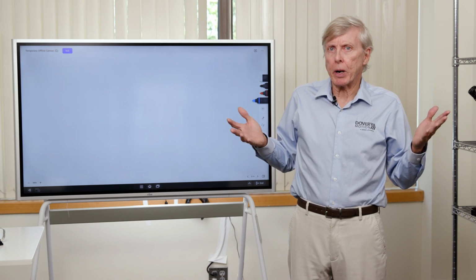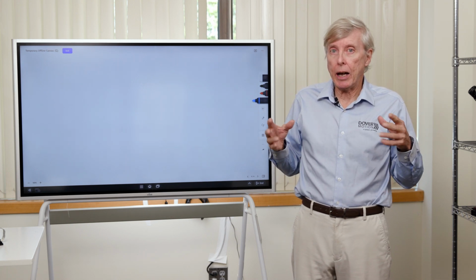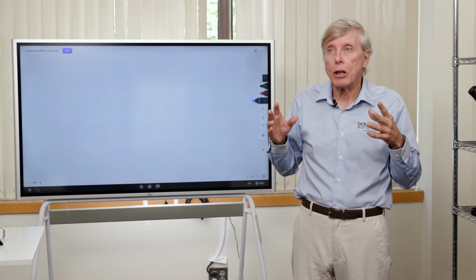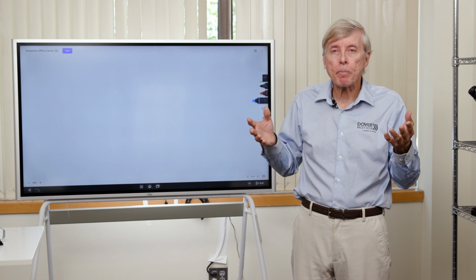In low throughput microscopy, it's typically a university researcher. There's an entirely different sort of microscopy which requires a very large number of images to be taken. This can easily run from thousands into the millions, and it's not done with a human operator checking through a trinocular eyepiece. It's done totally in an automated fashion. And in that case, throughput is very important.